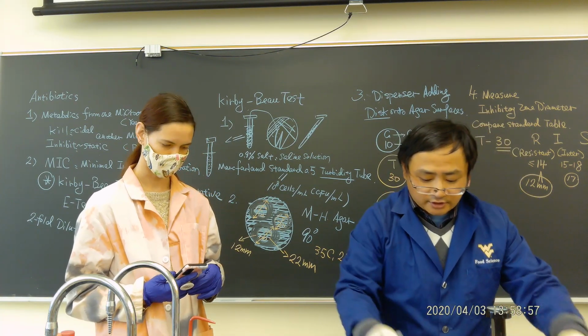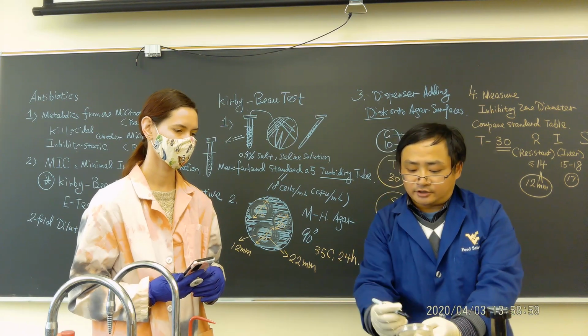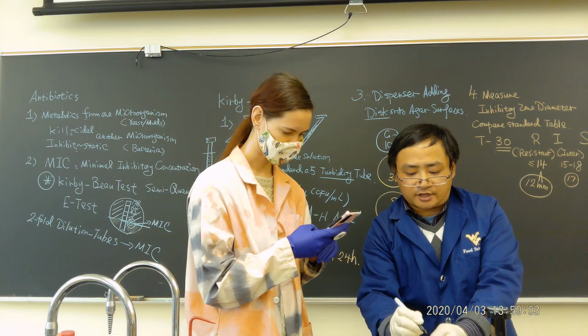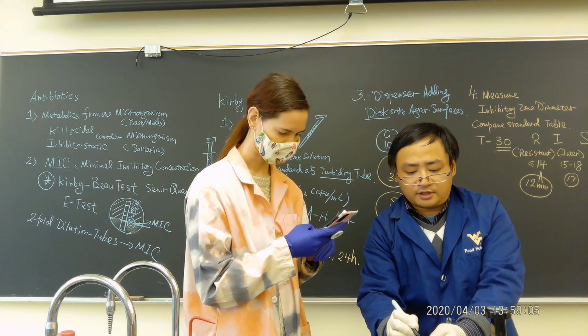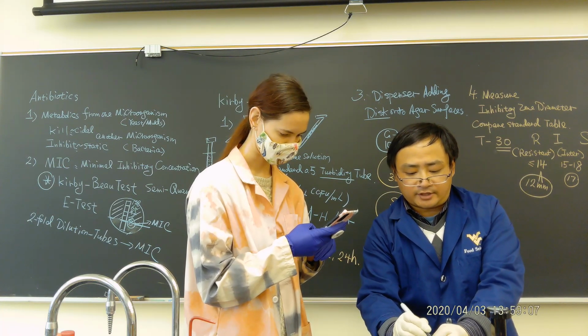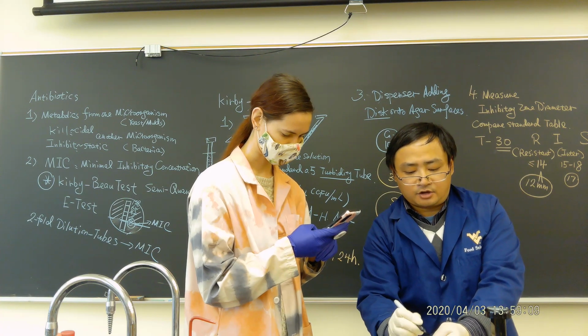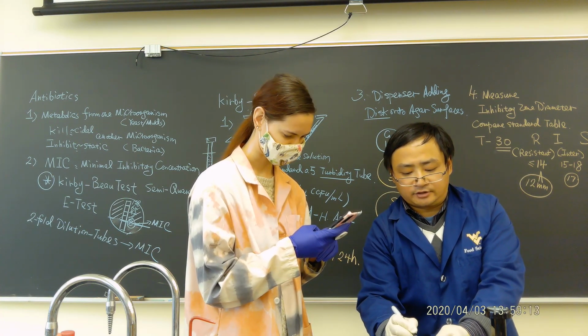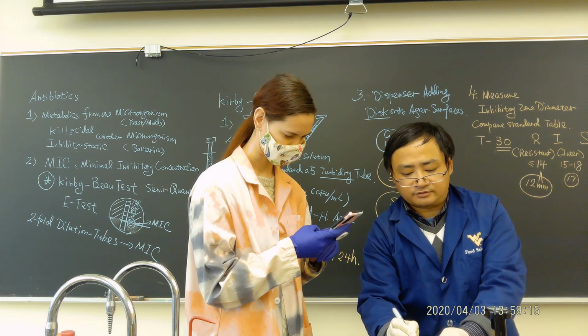Now what we have to do is label. This is Mueller-Hinton agar. You take a picture. So Mueller-Hinton agar we usually label like MH agar, and I'm going to add E. coli. So I write EC, E. coli, and my name, and batch number 1, and date 11/12.